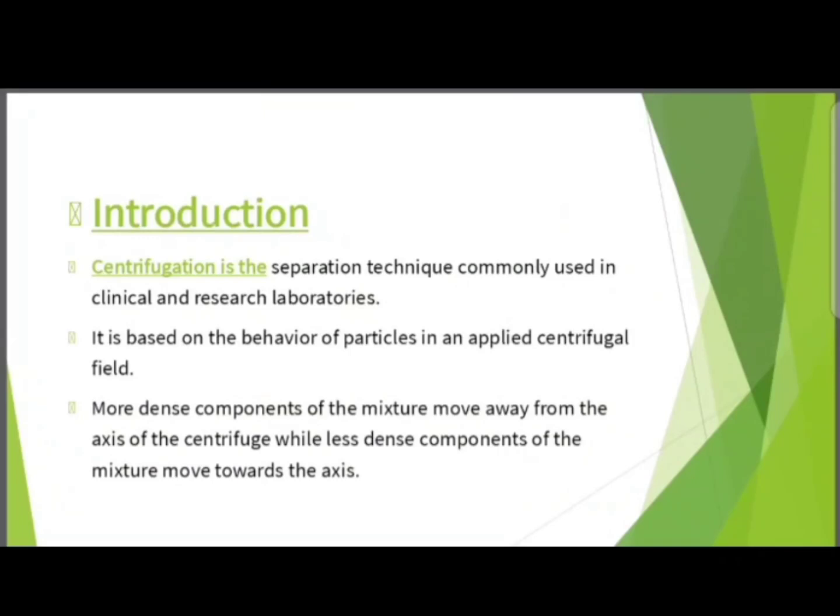Assalamu alaikum. I will explain now the introduction and principle of centrifugation.